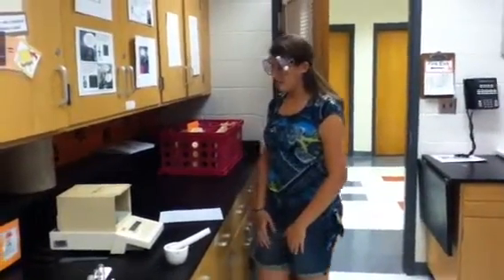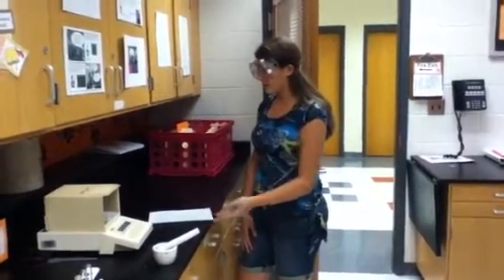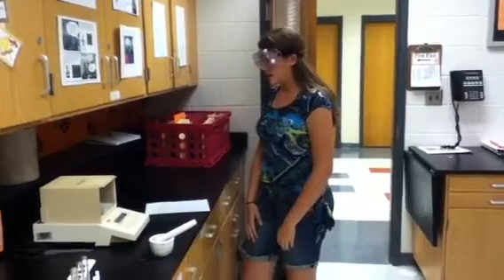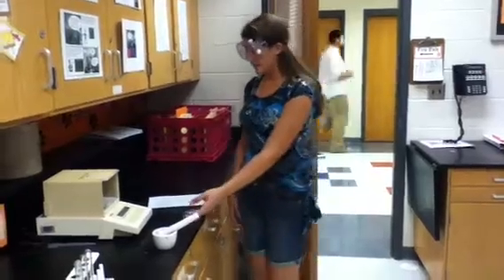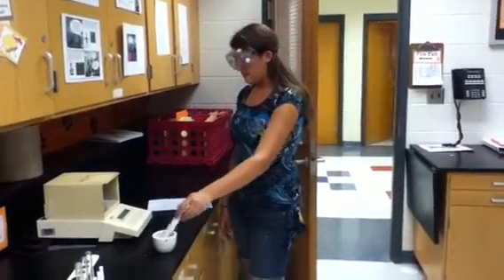A piece of equipment is called a mortar and pestle. This tool is usually made of porcelain and is used by chemists to grind crystals and other compounds into fine particles. It can also be used to pound chemicals into small powders. This round bowl-like part is a mortar and this hammer-like implement is a pestle.